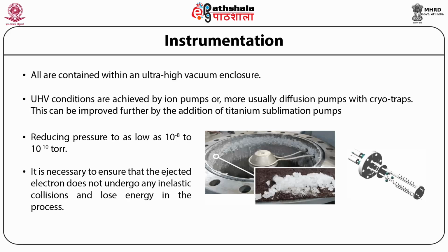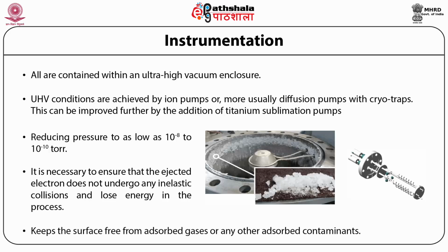It is necessary to ensure that the ejected electron does not undergo any inelastic collisions and lose energy in the process. This keeps the surface free from adsorbed gases or any other adsorbed contaminants.